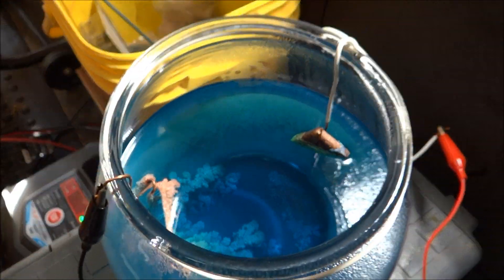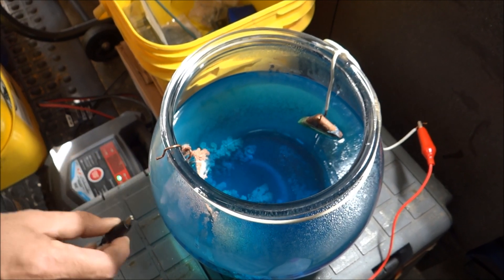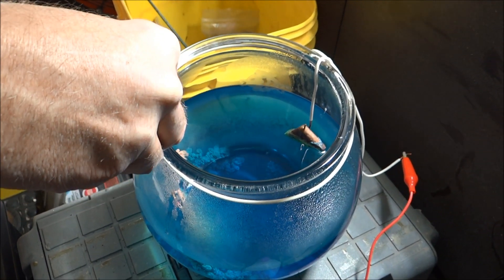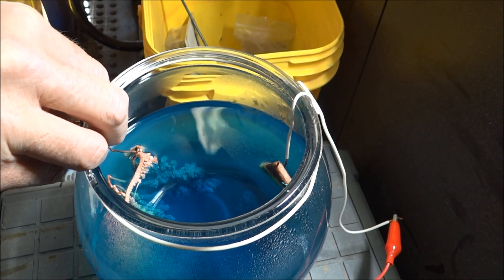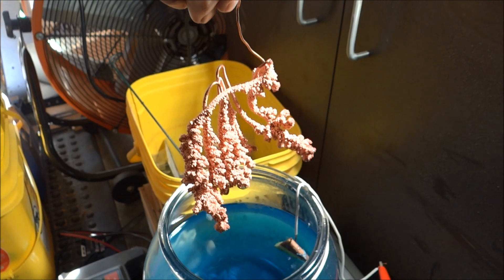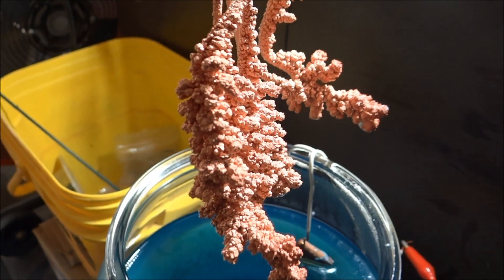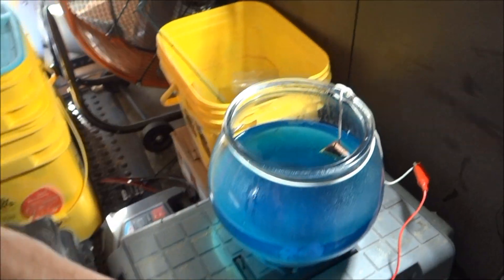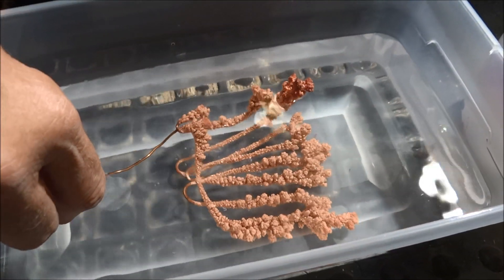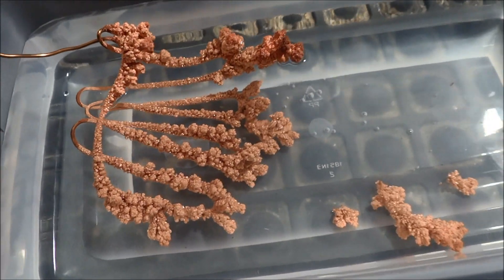First thing we do is disconnect the battery. Take off the sleeve here carefully. Oh my gosh - that's all pretty much pure copper! It's beautiful - it's like a reef. So I'm just going to put it in this water just to get the rest of that copper sulfate off of it. Carefully. That's pretty cool - see how it's breaking off so easily. That's okay because I'm going to smelt it down eventually anyway.